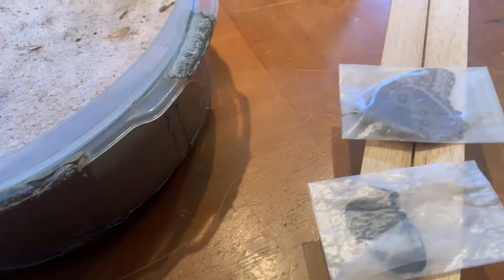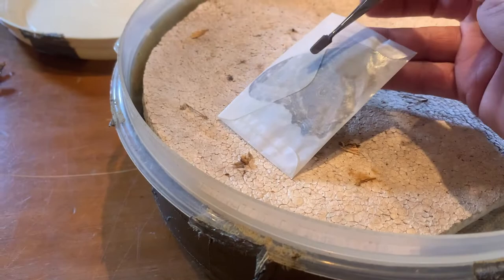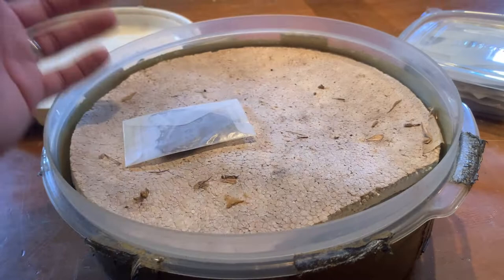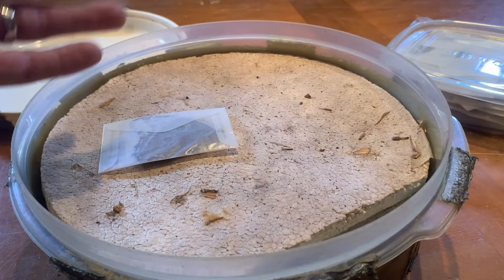Now it's time to put your specimens in. One of the things that's very important is to only put into your rehydration chamber what you can mount in one sitting. You don't want to put 50 butterfly specimens in a rehydration chamber if you only have the patience to mount 10, because then your specimens are going to sit in here and they're going to start to decompose because of the humidity. Even with the chlorocresol they may not fungus, but they will decompose if they stay in here long enough.